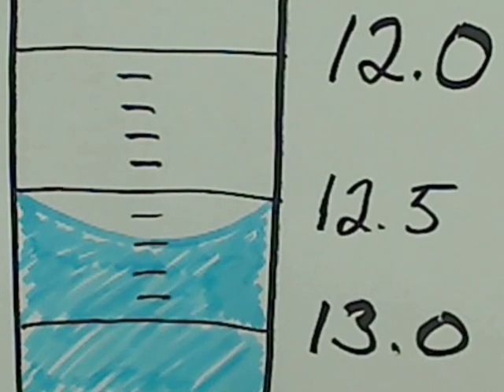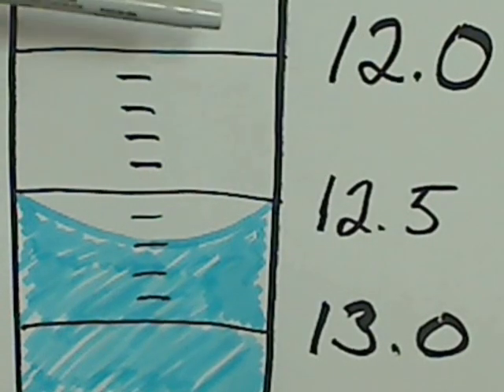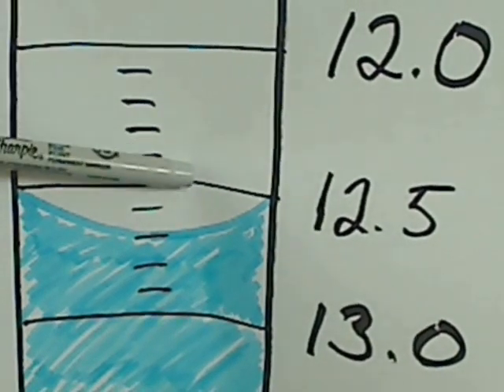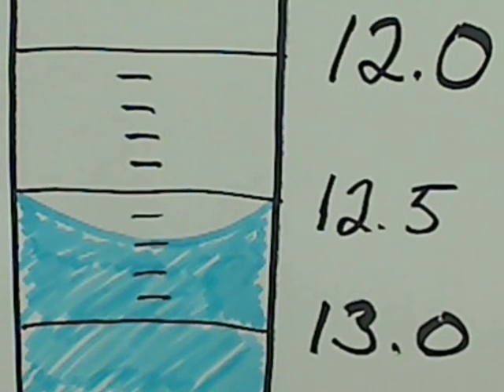That is how I would read this meniscus on a burette. Always start from the top number, count down, and then estimate that last one hundredth of a milliliter.